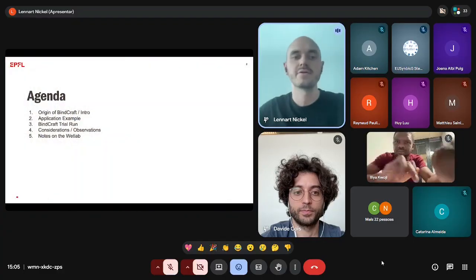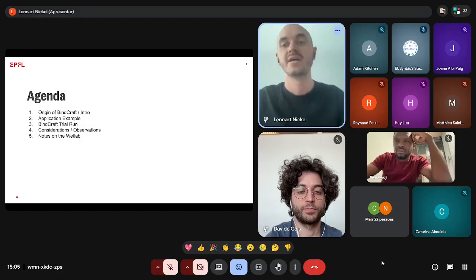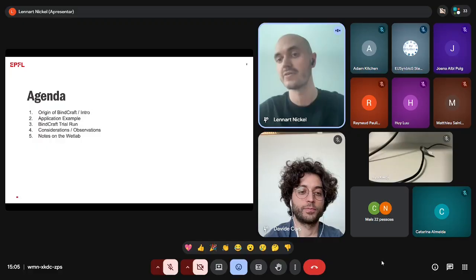So we will talk a little bit about where BindCraft came from and what the motivation behind it is. I will give an example of what we have been doing with it. And then, taking one of the examples that we have been working on, I will guide you through a trial run, and we will discuss the different settings and files that you would need to prepare if you would want to run BindCraft.